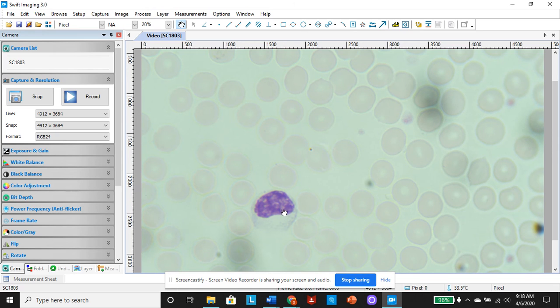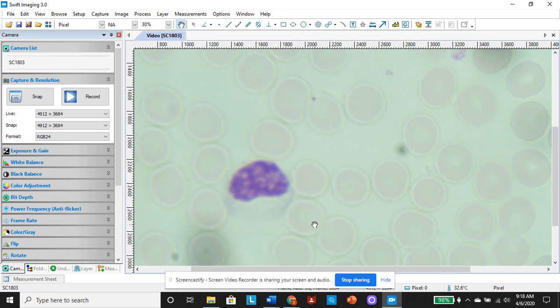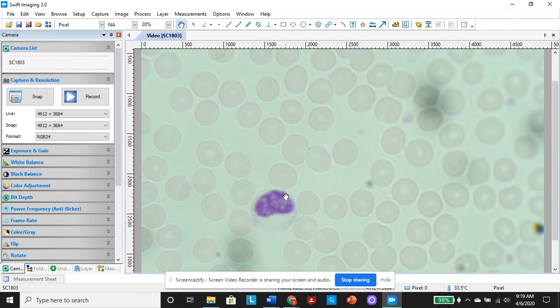It's all dense and compact. It doesn't look like any of the other lymphocytes that we've looked at, but that's what it is. Being able to differentiate these on a slide is pretty difficult, and it takes a lot of practice, getting used to, and training. But it's so much fun because you see some of the coolest stuff looking at these cells.